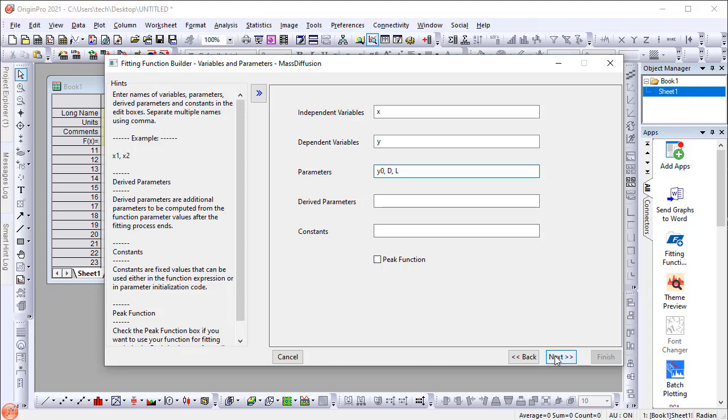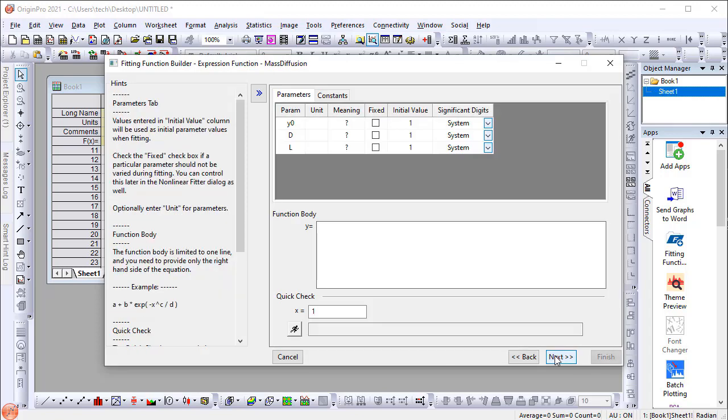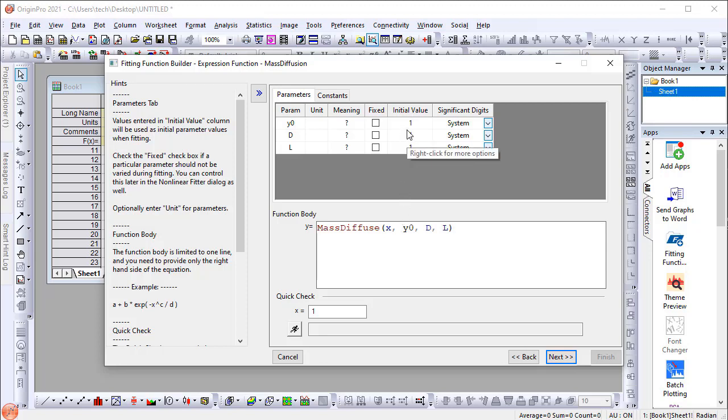On the fourth page, declare the function MassDiffuse X, Y0, D, L. Change the initial values, then click Finish.